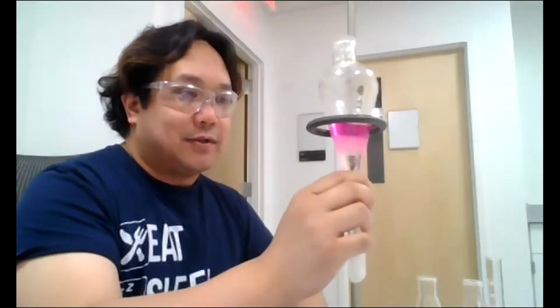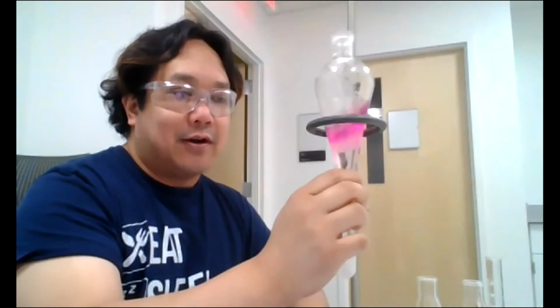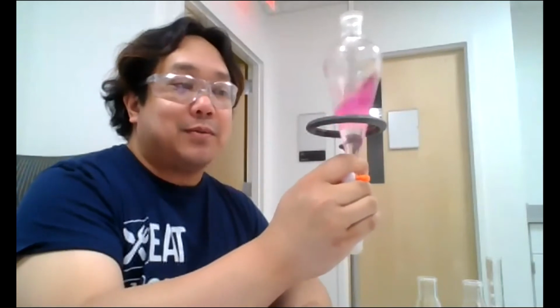All right. While this starts to separate, I don't know if you can see it, but the bubbles are starting to dissipate. I really want to see two distinct layers with a very clear border. Okay? So, very clear border. Sometimes we're not going to get that.